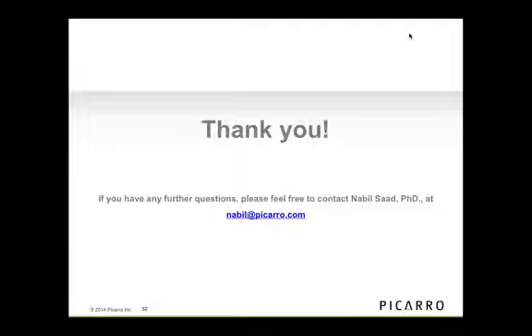So basically on the monitor of the Picarro analyzer, you'll see a window with the flux measurement coming straight from the Forerunner chambers, and you see the Picarro analyzer user interface. In the case of other vendors, you can always interface the chambers together with the Picarro analyzer, but you won't get the seamless interface of the software the way it does with the Forerunner.